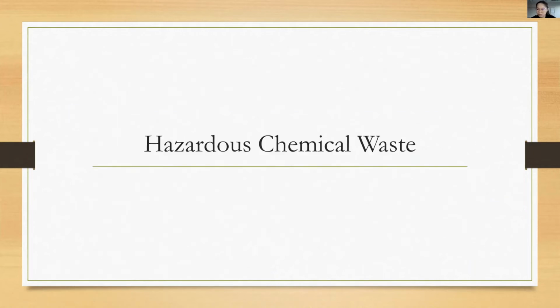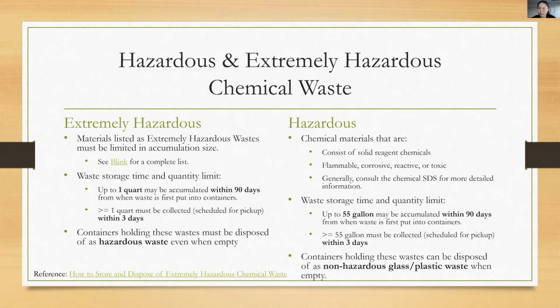So now let's go to the hazardous chemical waste. First, I want to define the difference between hazardous and extremely hazardous chemicals. It is important to make them different because the empty containers that hold extremely hazardous chemicals have to be disposed of as hazardous waste, but the empty containers that hold hazardous chemicals can be disposed of as non-hazardous glass or plastic waste.